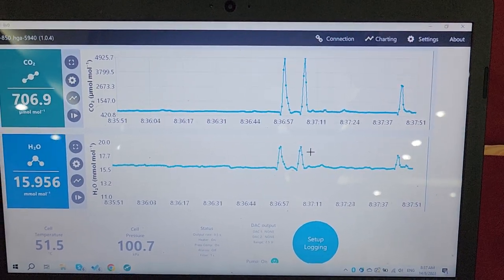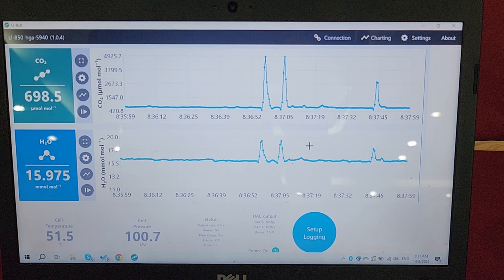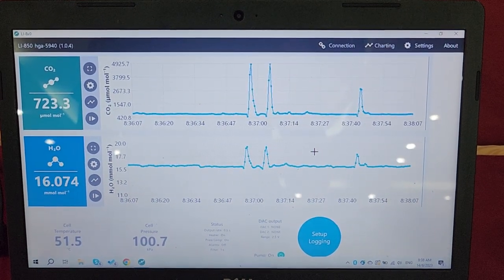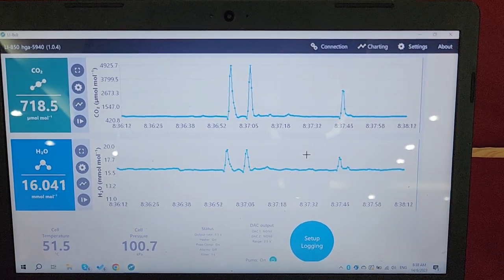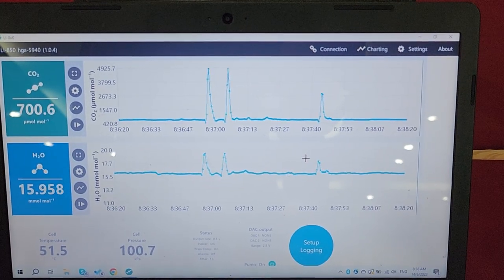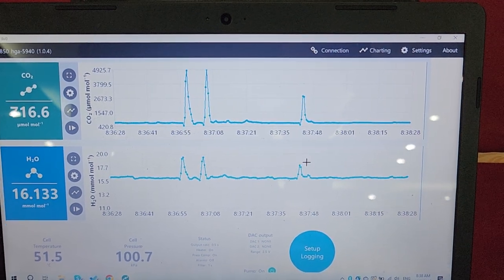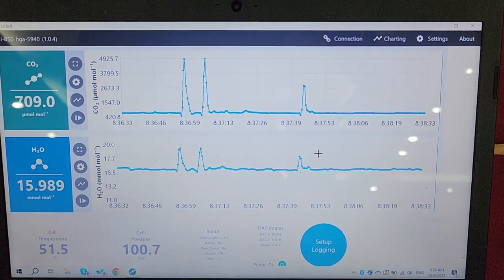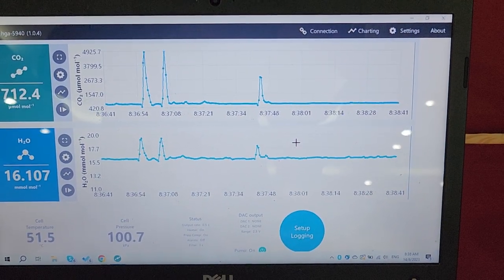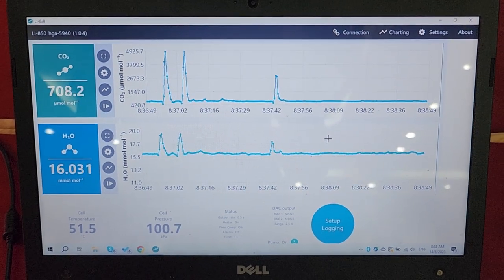Water vapor. So why is this important for plants? You see, plants need CO2 as one of the ingredients to do photosynthesis. Okay? But what about water vapor? This water vapor is not absorbed into the plant. So this water that you see down there has impact on relative humidity, RH, meaning the percentage of moisture that is possible to be present in the current atmospheric condition. RH is not going to be the same, even though your water volume is similar between two places. If in here you got about 15, 16 millimole of water, let's say that the RH now is 70. The same volume of water, you put it in a different location, let's say Cameron Highland, the RH is not going to be the same, okay? Because the capacity of the atmosphere to hold the water is different now, right? So this is important to the plant.